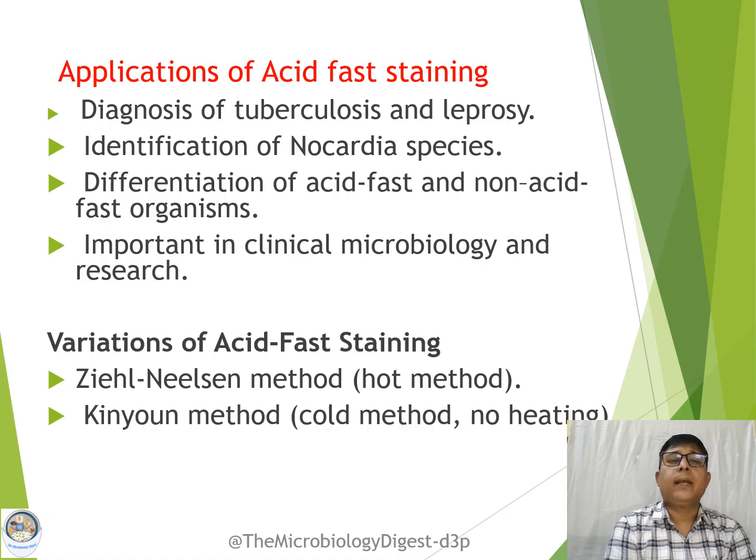Before that, when we go for applying acid fast staining, the main application of this staining technique is in the diagnosis of tuberculosis and leprosy. So these organisms are acid fast organisms, and they are required to be stained by this technique.